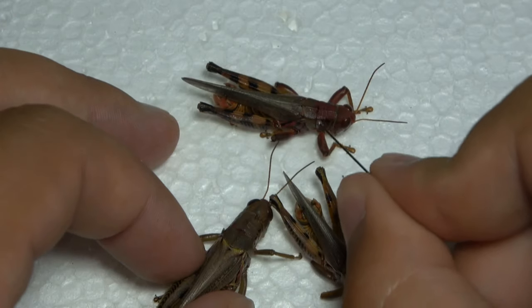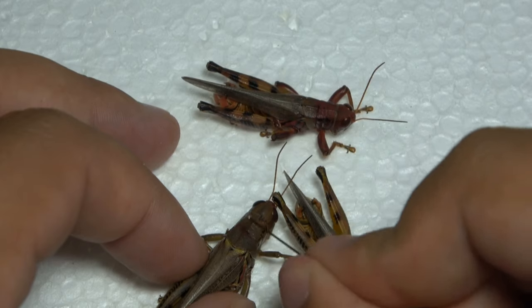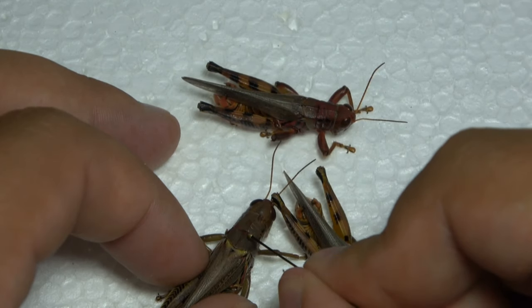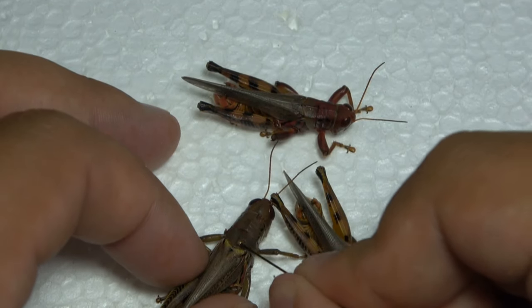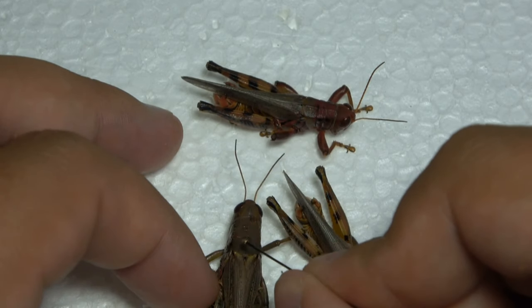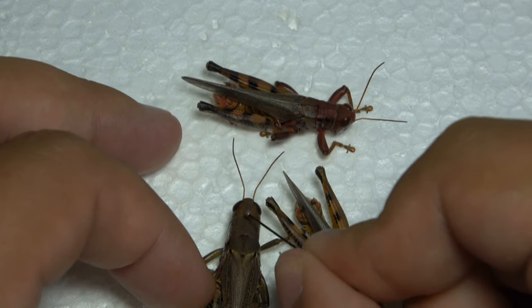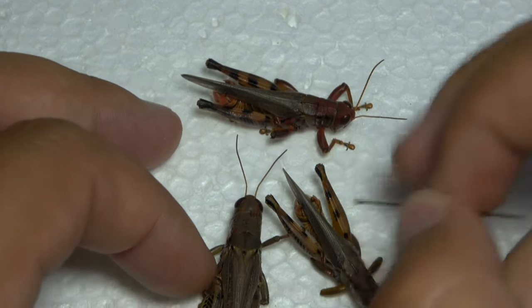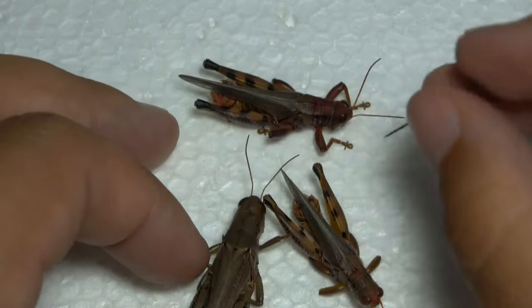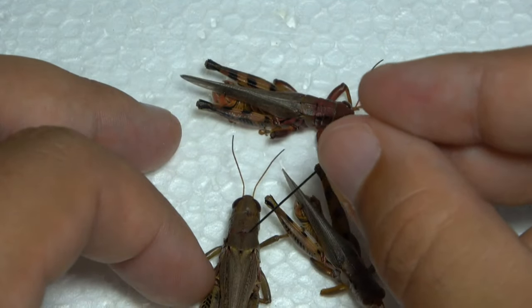You can see it on this specimen right here. If you can see that ridge that goes down the middle, that is called the median carina. It separates the right side and the left side. In grasshoppers you always want to put the pin through the right side.